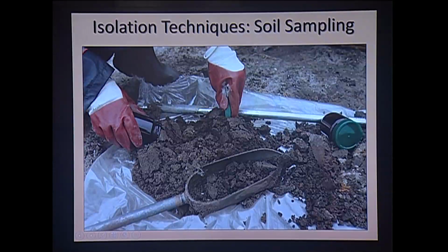Then cool it down. We will also be doing the soil collection during this time because this is a very important part. Collection of soil requires sterile containers and sterile augers. If at all it is not sterile, aseptic processes should be followed as far as possible. Now we are collecting rhizosphere soil, but we will take some 3-4 samples and then mix them together. While we bring it to the lab, if there is a time lapse, it can be stored in the refrigerator.